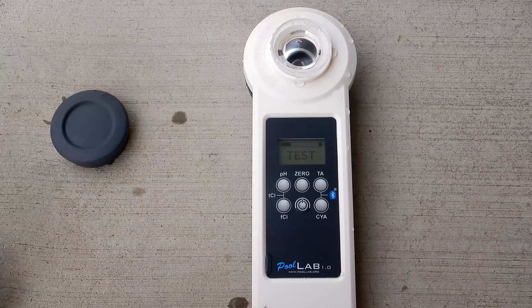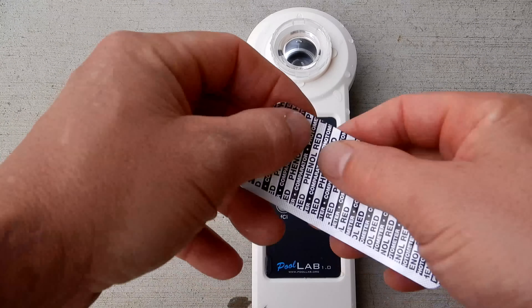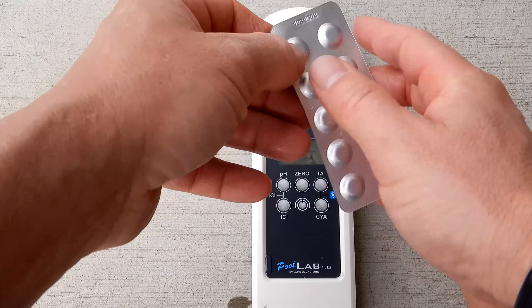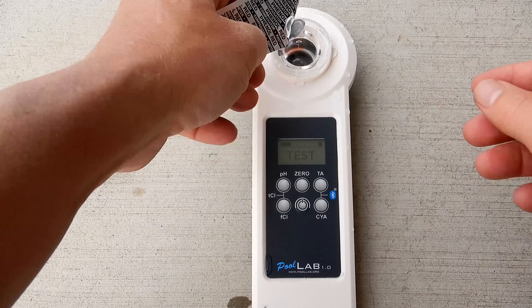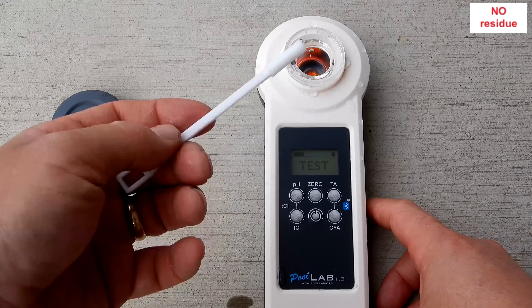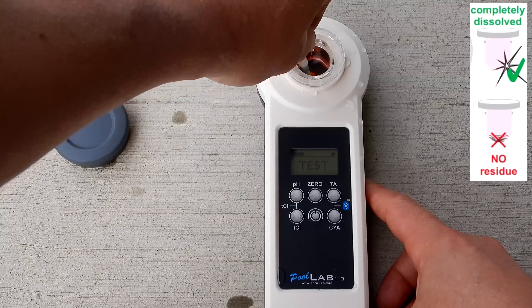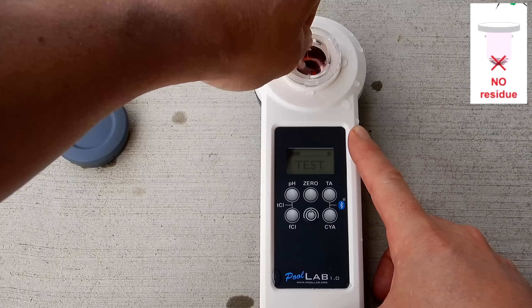Go ahead and remove the cap. I'm going to start with the pH test. You don't want to touch the tablet, so I'm going to go ahead and just push it through here. You can see the tablet in here — we're going to break that up and stir it. Take the included stir and crusher and break up the tablet. You want to make sure the tablet is completely dissolved before you run the test.